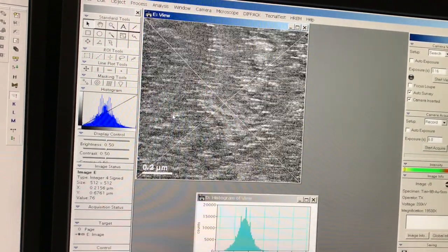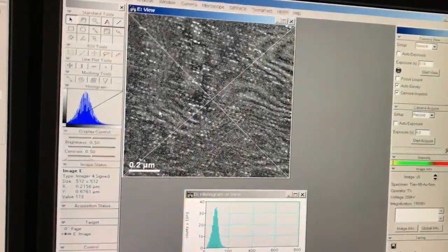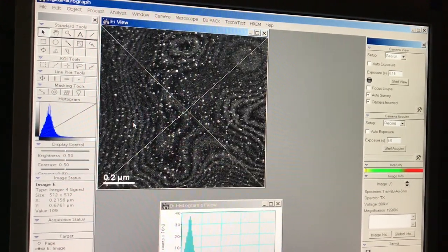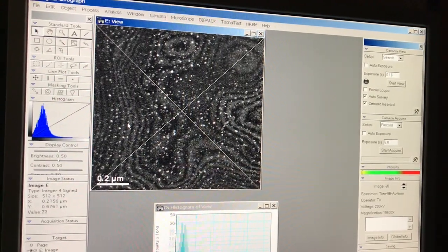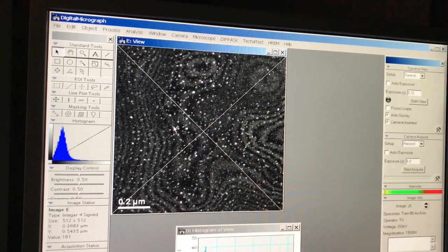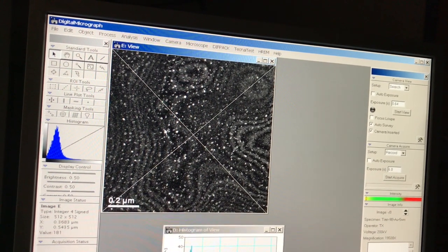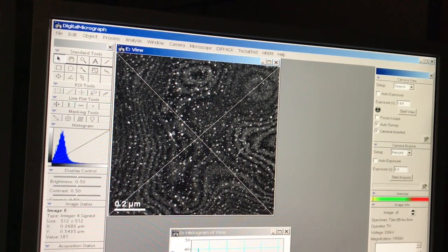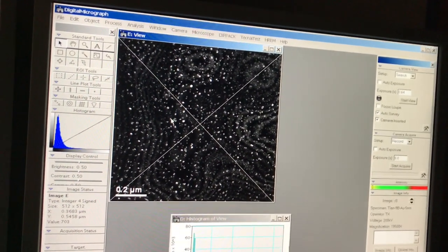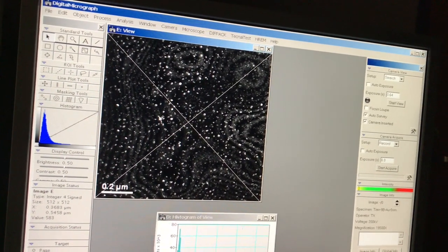Okay, but you can see here this is actually a little bit better area than what we had. The only point is you probably want to be just a little cautious about doing a large move with the sample, because more than likely your sample isn't flat and you end up with a slightly different two-beam condition than what you initially had, where your S might not be 0 initially, it might be positive or it might be negative.